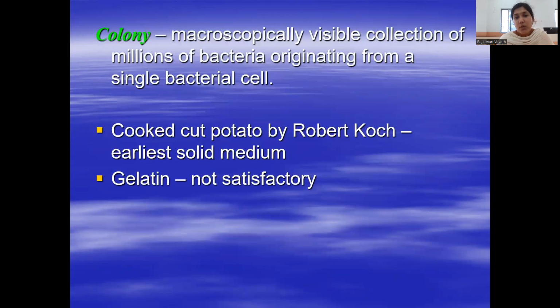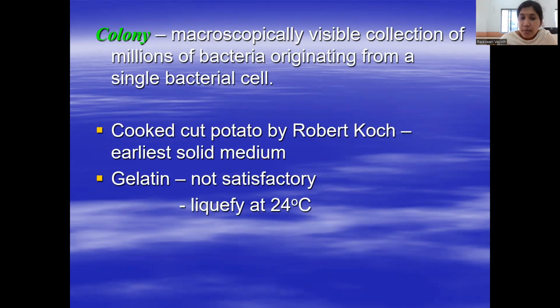Cooked cut potato was used by Robert Koch; it was the first solid medium. Gelatin was used as the solidifying agent in the solid culture medium, but it was not satisfactory. It liquefies at 24 degrees Celsius.